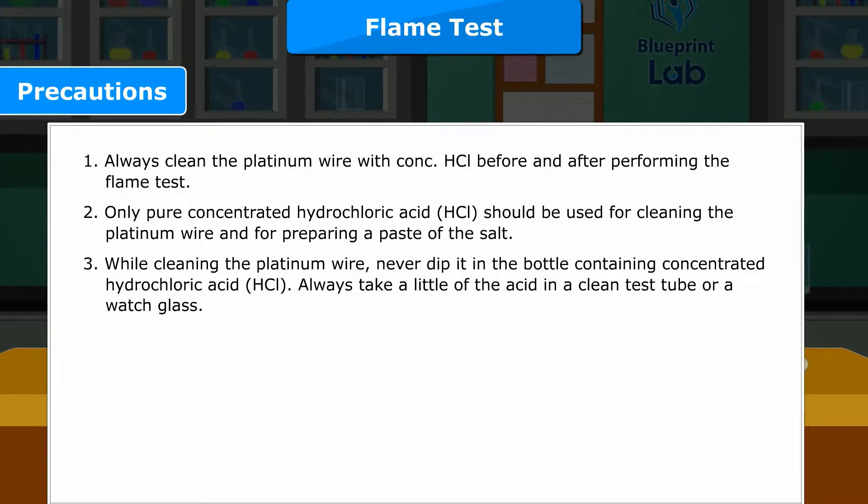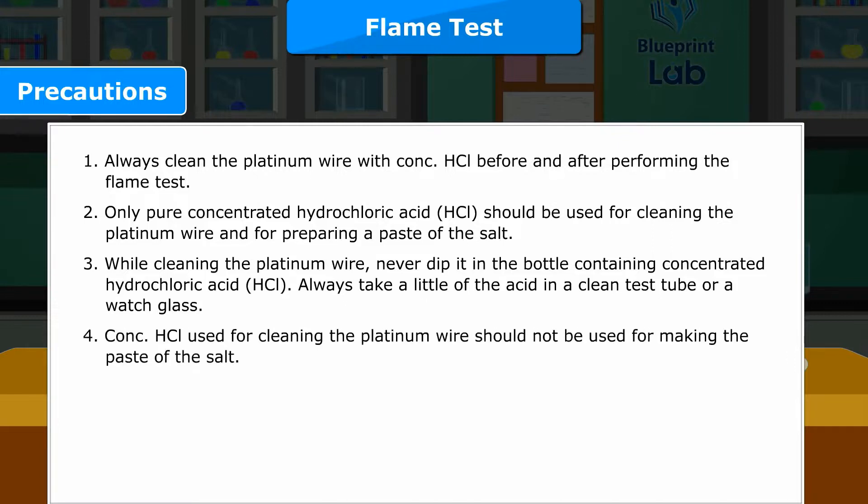Precaution 3: While cleaning the platinum wire, never dip it in the bottle containing concentrated hydrochloric acid. Always take a little of the acid in a clean test tube or a watch glass. Precaution 4: Concentrated HCl used for cleaning the platinum wire should not be used for making the paste of the salt.